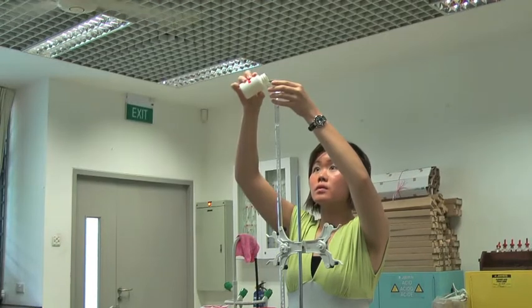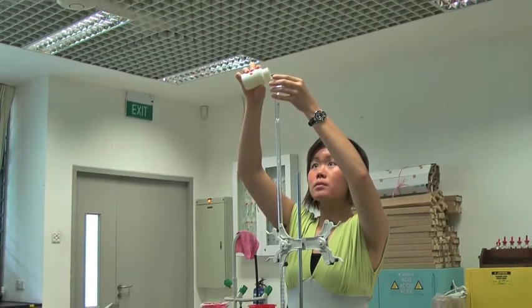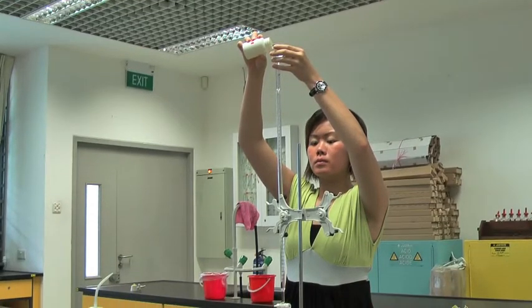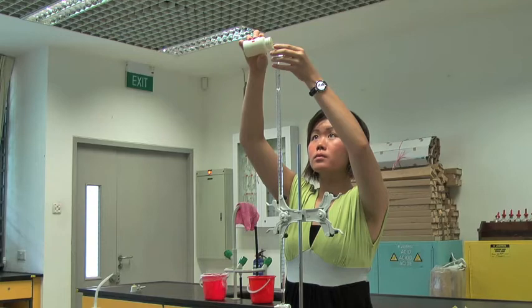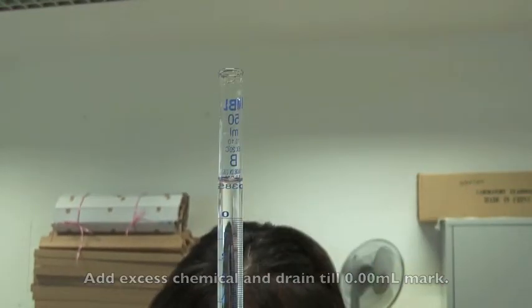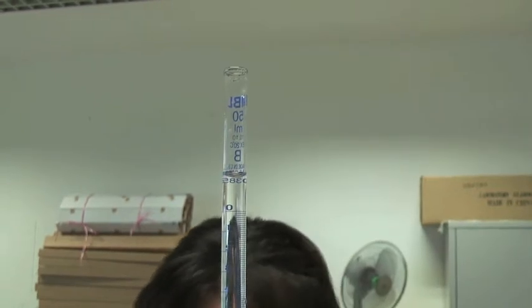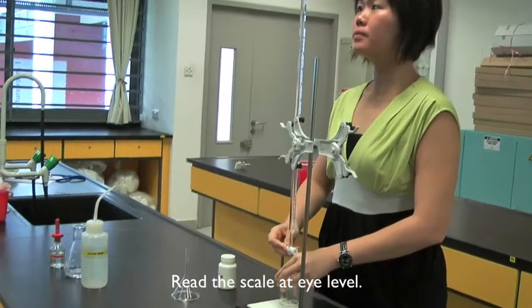Transfer the chemical into the burette using a funnel. Add excess chemical into the burette to above the 0 cm³ mark. Then, run this chemical to the 0 cm³ mark.